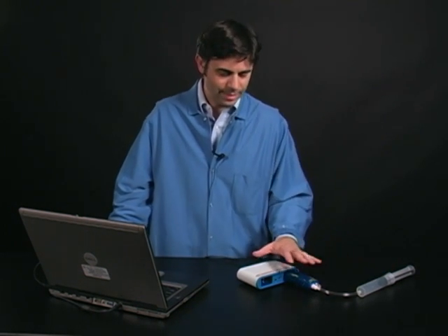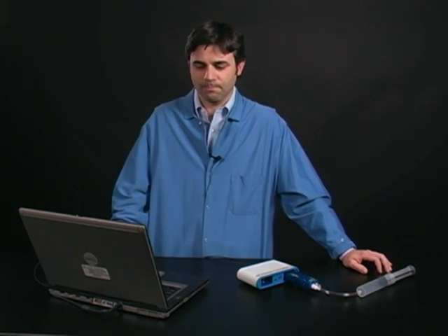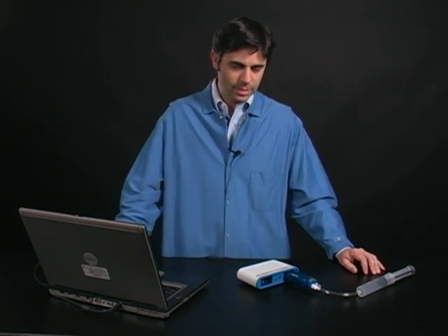Hi, this is Tom Moschiavo, Chemistry Education Manager at PASCO Scientific, and I am here today to talk about chemistry from a macroscopic and molecular perspective using PASCO's equipment and SparkView software and Odyssey software for molecular visualizations. So let's take a look.